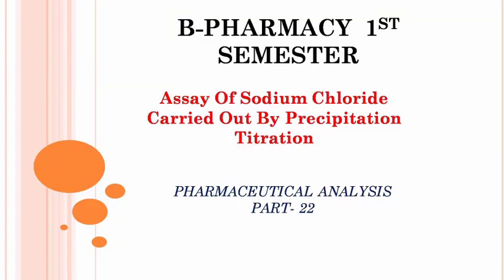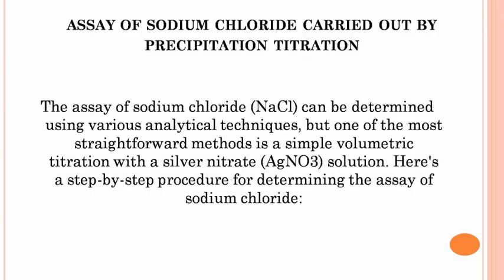Hello friends, welcome to the last topic of precipitation titration. That is, assay of sodium chloride carried out by precipitation titration. So let's start this video. Assay of sodium chloride carried out by precipitation titration.